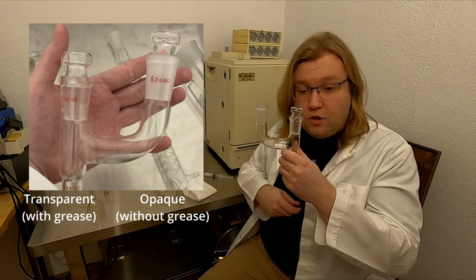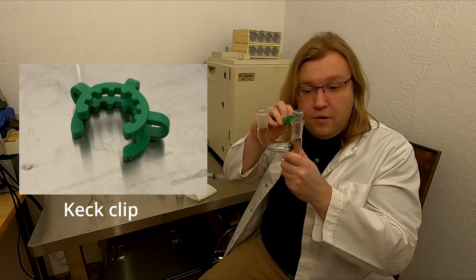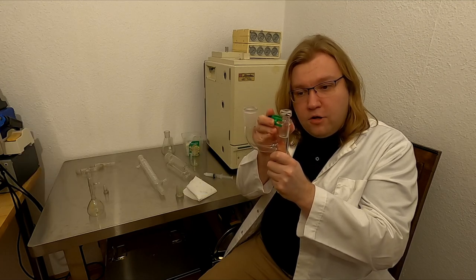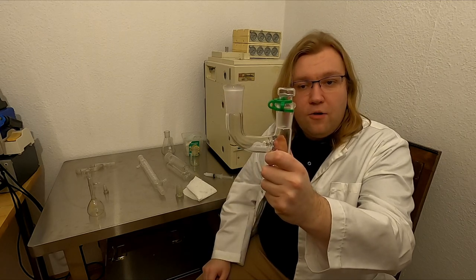You can secure a joint by adding a so called keg clip. A small plastic clip holds the joint together. Slide it sideways onto the joint, till it snaps into place securely.